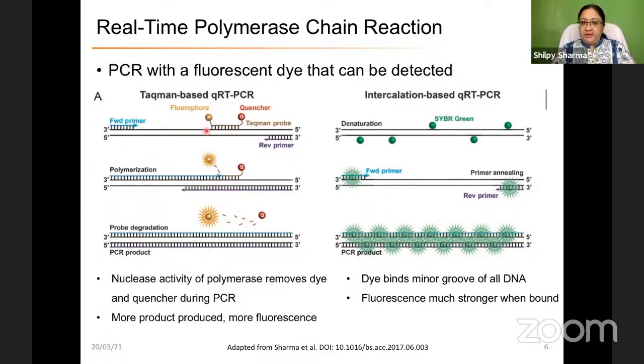So when you add your primers with your probes, this probe is also going to hybridize to your template. The difference from the forward and reverse primers is that the probe contains a fluorophore as well as a quencher. In the state where it is hybridized to your template, the fluorophore is masked by the quencher, as a result of which no fluorescence is emitted.